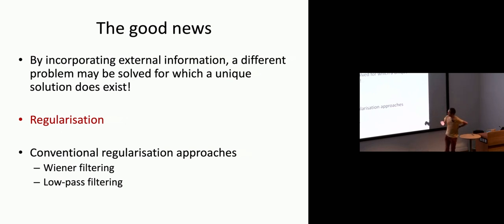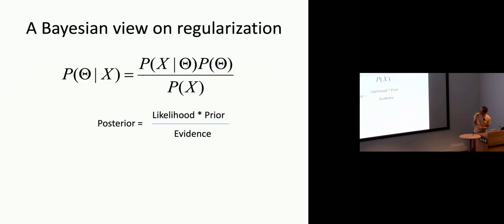Before the implementation in RELION, people would be doing regularization, but in an ad hoc manner. So low-pass filtering and Wiener filtering were all done empirically with filters, and you could become very good at this. A good image processor would know exactly which filters to tune to keep the noise that shouldn't be there at bay, but still preserve as much signal as you could. This changed with the introduction of this Bayesian framework to do the image processing.